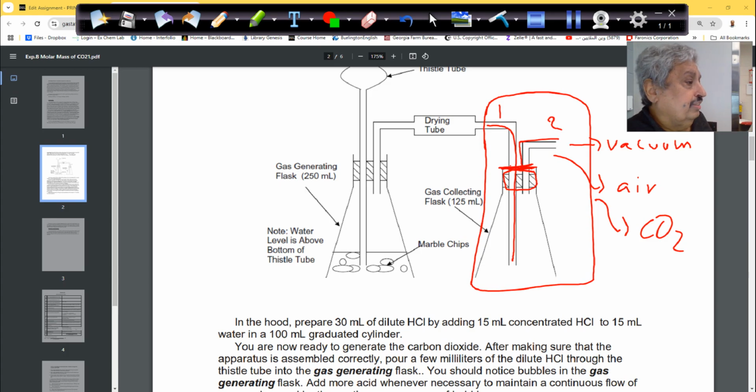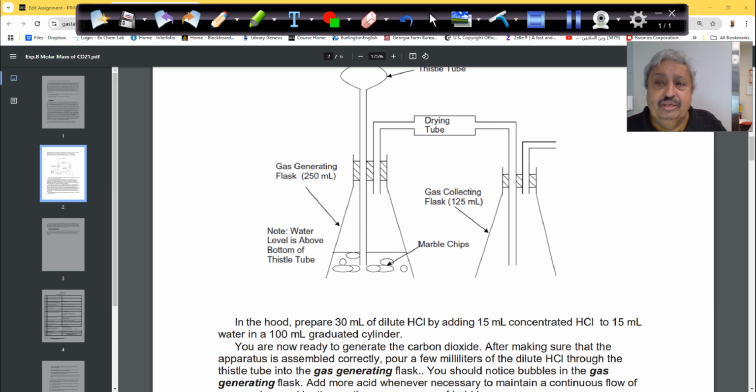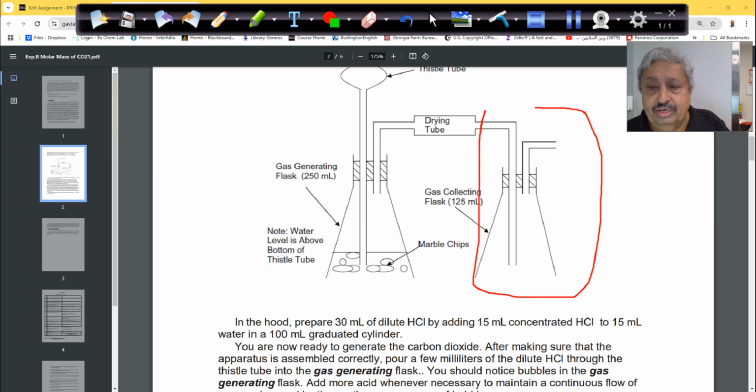Can you see it? Can somebody show her where the tubings are? Don't take the adsorbent calcium chloride. Somebody can show her the whole thing. How does it look? I might Google that to show you, so the picture may not be clear, but all the time you treat this one here from this side, guys. You cut it off from this side. This is the one you are working with. This one, you don't touch.